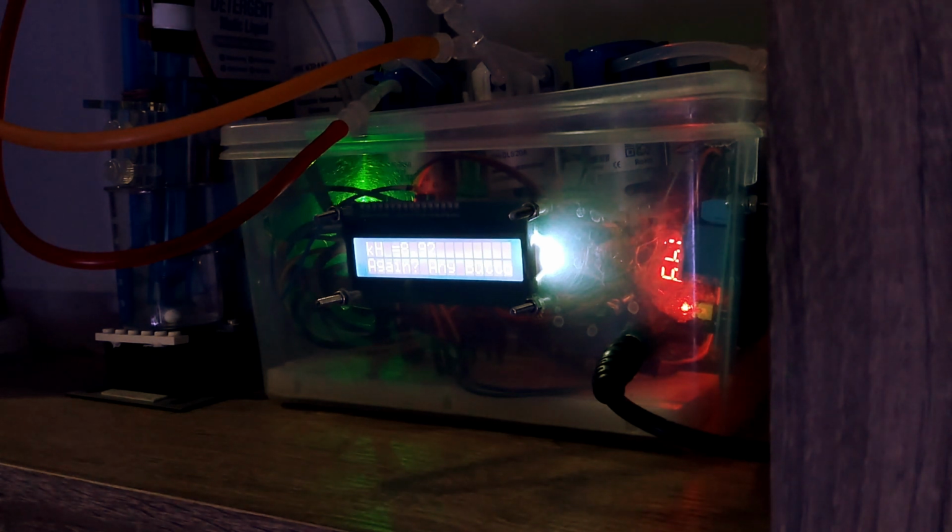So that's it from me, and I will later provide you with the video of the principle of the titration to get alkalinity, and also the video on how to set up several devices such as the pump and the pH probe for the Arduino Uno, based on other videos.